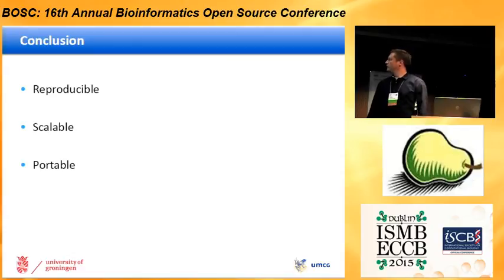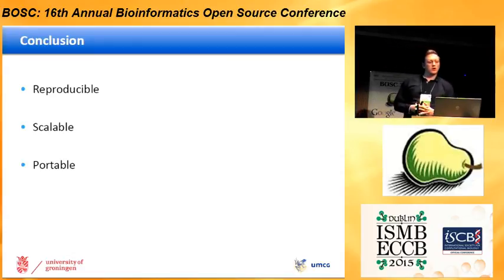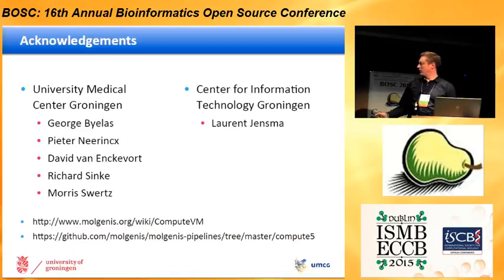So yeah, then the conclusion: we've created a VM image which makes the research reproducible. By using OpenStack, it's quite scalable, and it also makes it portable and easy to use for biologists. And everything is available over here in the bottom.